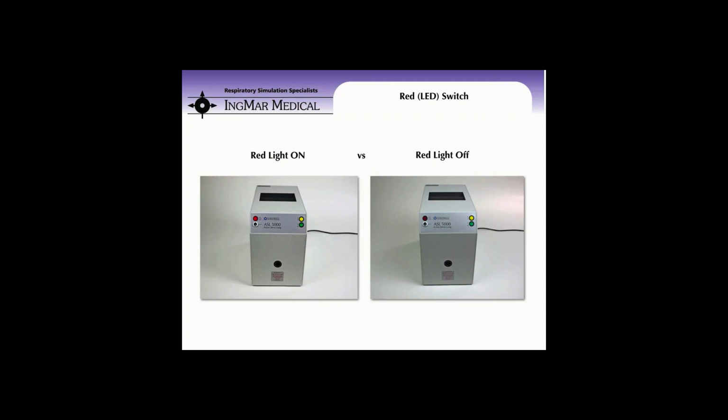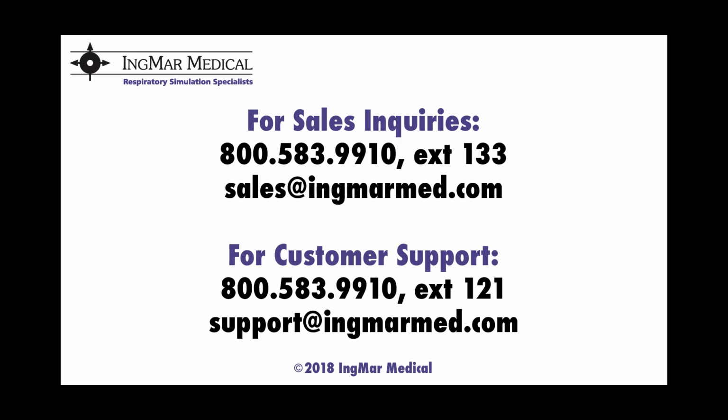Yeah, so let me go ahead and for these additional questions, let me put that slide back up with the contact information right here. Yes, so that's correct. I guess the very first thing would be to make sure that that red light is pressed in. And then if that doesn't resolve your issue, then you would want to contact us directly.